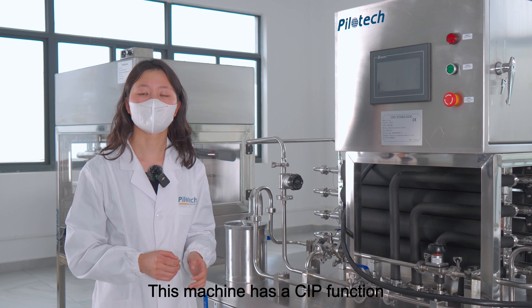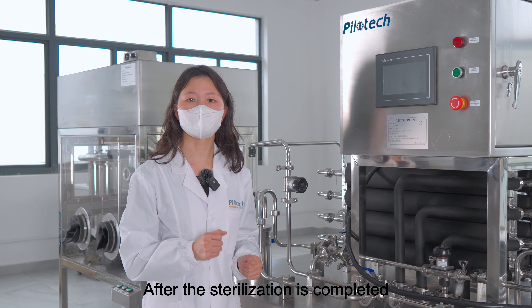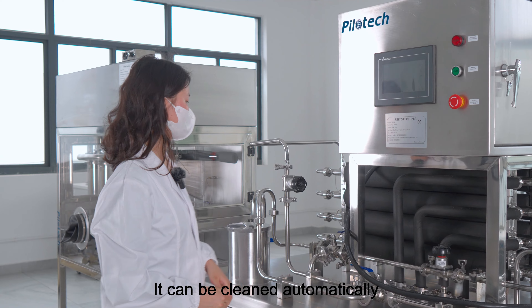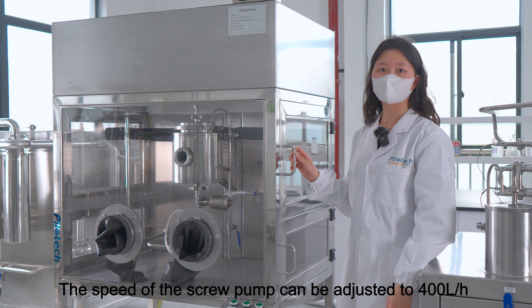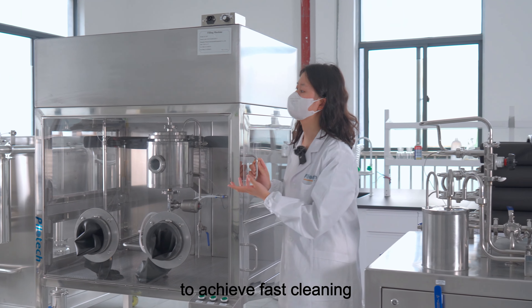This machine has a CIP function. After the sterilization is completed, it can be cleaned automatically. The speed of the pump can be adjusted to 400 liters per hour to achieve fast cleaning.